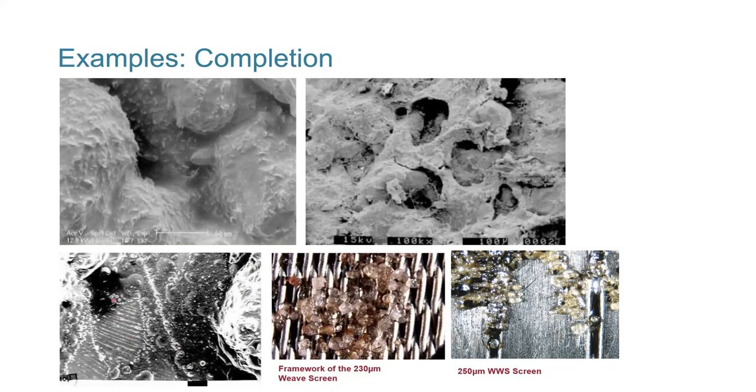And then more significantly, this area here, which looks stripy, and there's another one here. These are two individual droplets of the completion fluid that are trapped in a pore throat. So there's a pore throat down here somewhere. And what we've caught in this image is phase entrapment, water block, whatever you want to call it. What's happened is the fluid has gone in this direction during fluid loss, during well operations, and then production has been from the top right to the bottom left. And these droplets have got jammed in a pore throat, and they've restricted that pore. This pore is blocked off because the filtrate or the retained fluid is blocking it off. So again, seeing what has caused that allows us to think about how we can fix it.